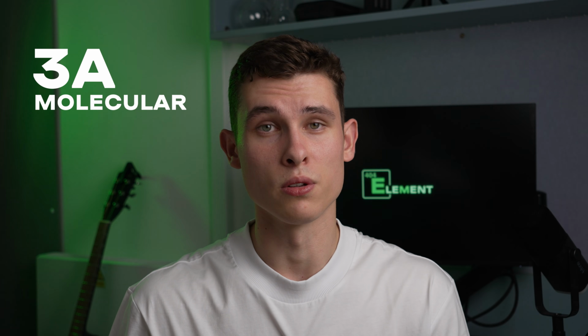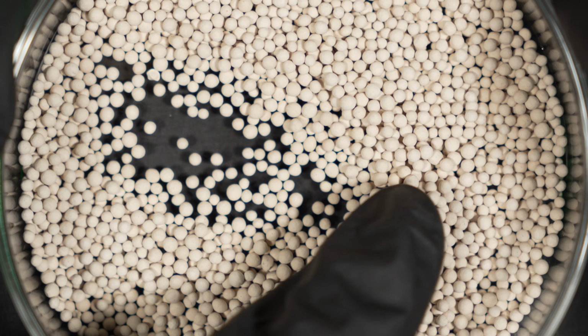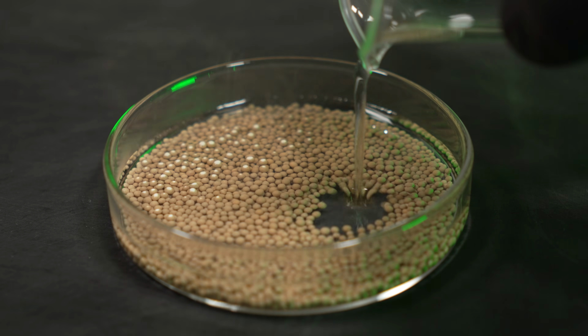The problem with the Fischer reaction is its sensitivity to water. Sulfuric acid acts as a strong dehydrating agent and a catalyst for this process. But I found a very interesting paper where they used water-absorbing agents as a replacement for concentrated acid, specifically 3A molecular sieves. For those who don't know, these are porous beads of aluminosilicate whose pores are sized so water gets trapped while other molecules pass by.